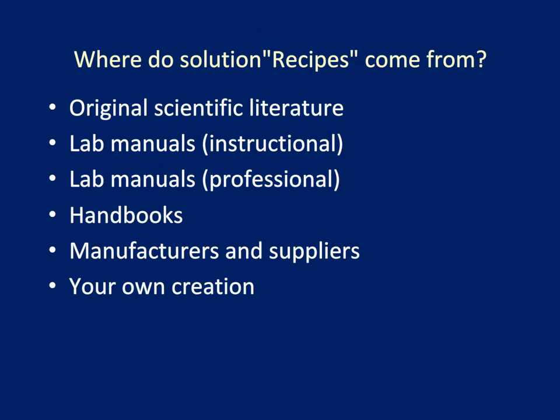Solution recipes come from a variety of sources. The source you use depends on the application that you have. If you are working on a particular protein, or possibly a specific method, you may consult scientific literature as a starting point for your solutions in your experiment.